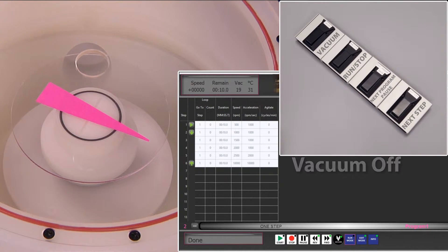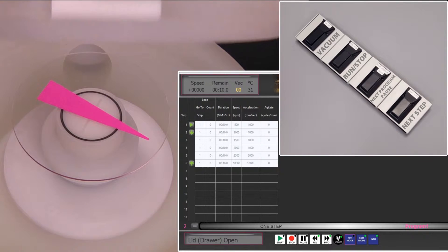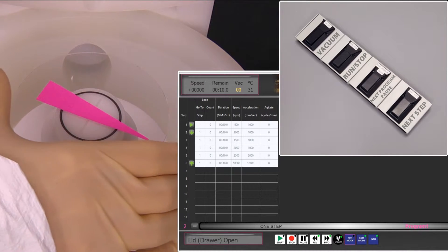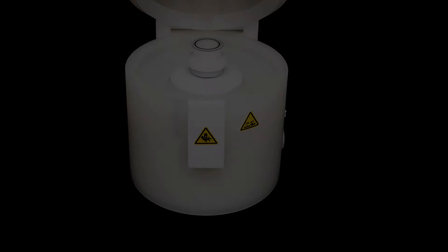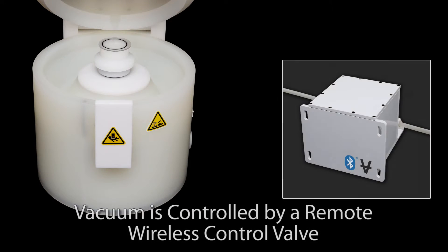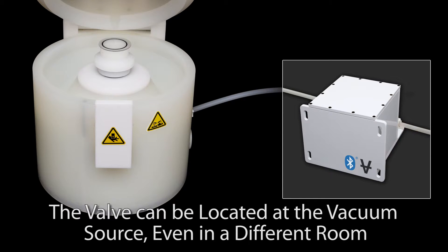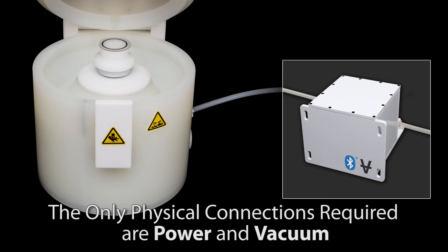Bluetooth wireless connectivity allows us to cut the cord between system and controller. Our independent wireless vacuum valve can be located at the vacuum source. The only physical connections required are power and vacuum.